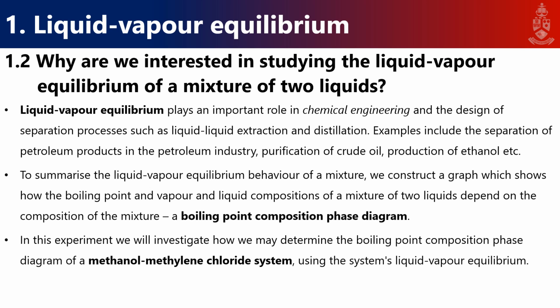So in this specific experiment, we're going to look at the boiling point composition phase diagram of a methanol methylene chloride system using the system's liquid vapor equilibrium.